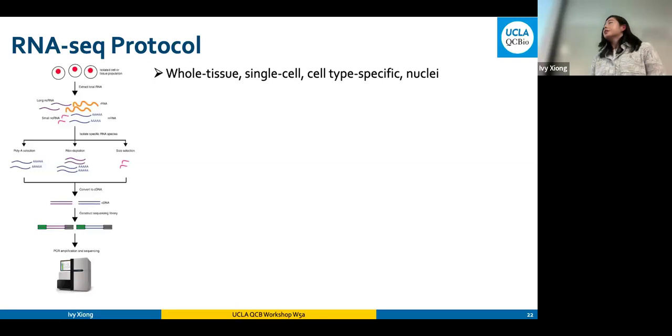So let's first try to understand what the RNA-seq experiment is. A lot of you have gone through some of the experiment yourselves, so we'll fly through this part quickly. We start with the whole tissue, and we want to homogenize it to single cells, or sort them first through FACS. Anyway, we end up with a pool of cells, and we want to digest them. We want to smash them to get the mRNAs out.